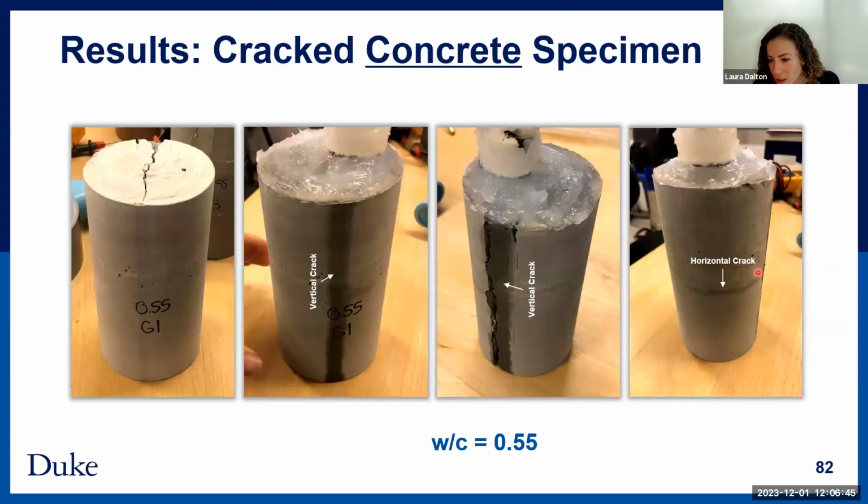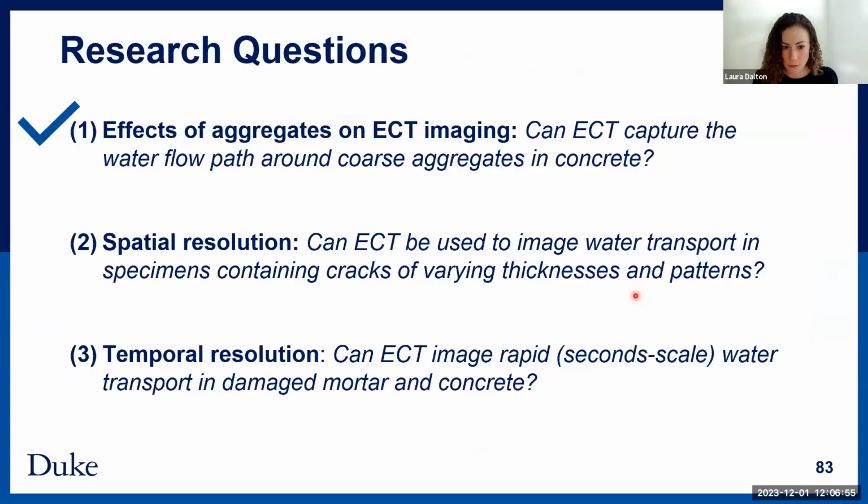I have some images. It's right here, post-experiment. So the spatial resolution was enhanced from previous people who have looked at this. That was a big part of what we were able to achieve with this study. And again, I want to study this in the context of CO2 and carbon capture and storage, but for proof of concept, it was just with water to simplify for now.